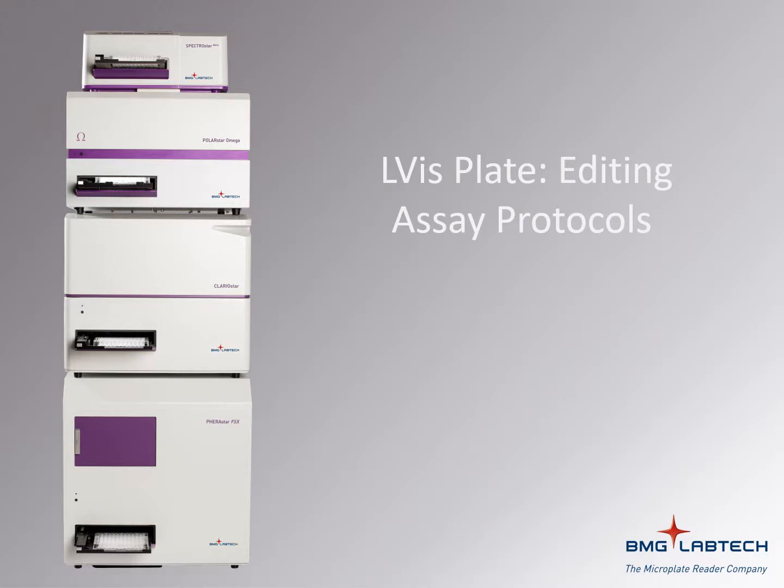Although your BMG software contains default protocols to read your LVis plate, it is sometimes beneficial to make sure that everything, including plate layout, is set up to your satisfaction before you read your samples. This video will provide a couple of examples of how these changes can be made.